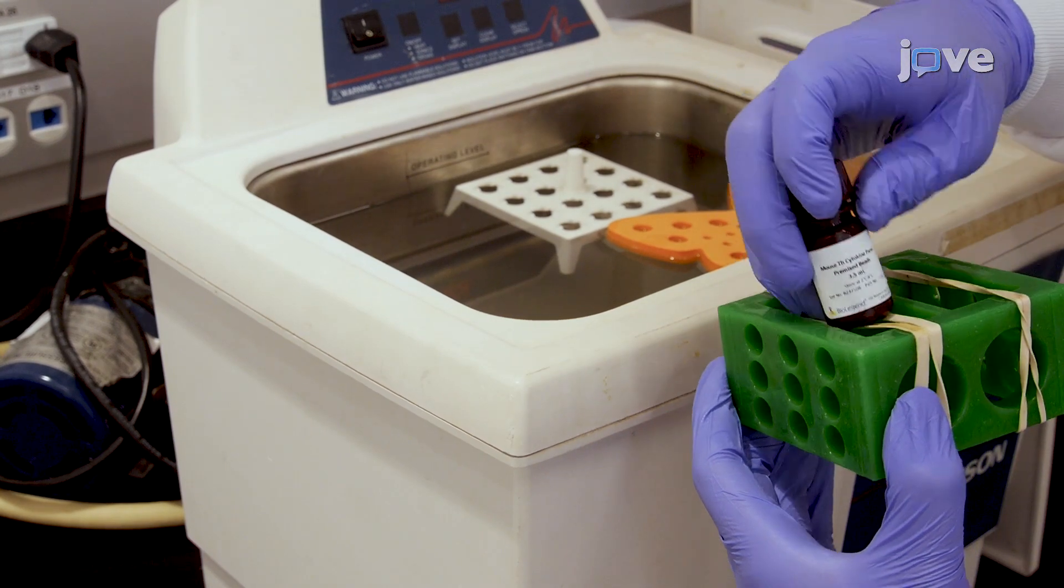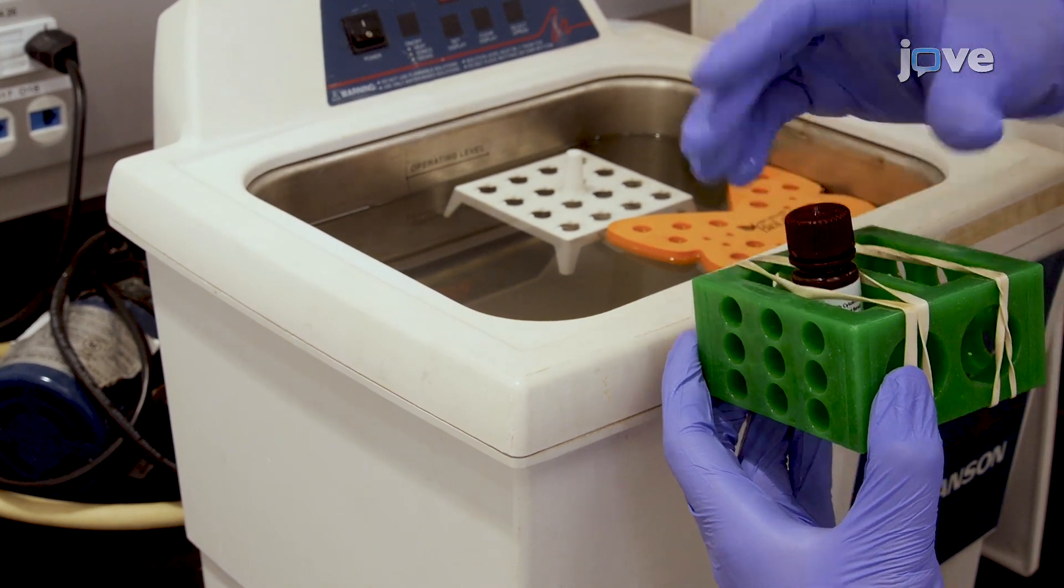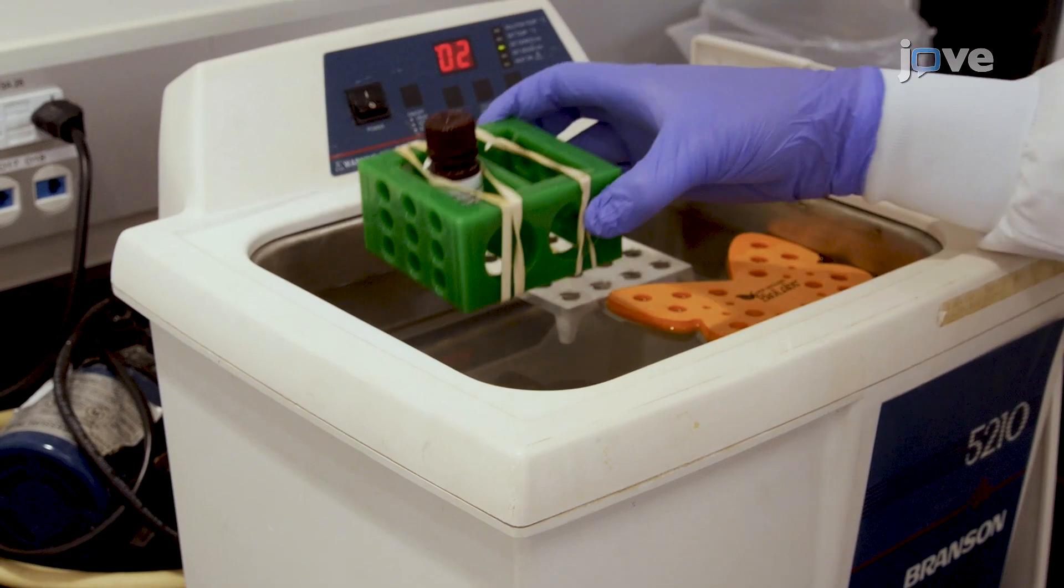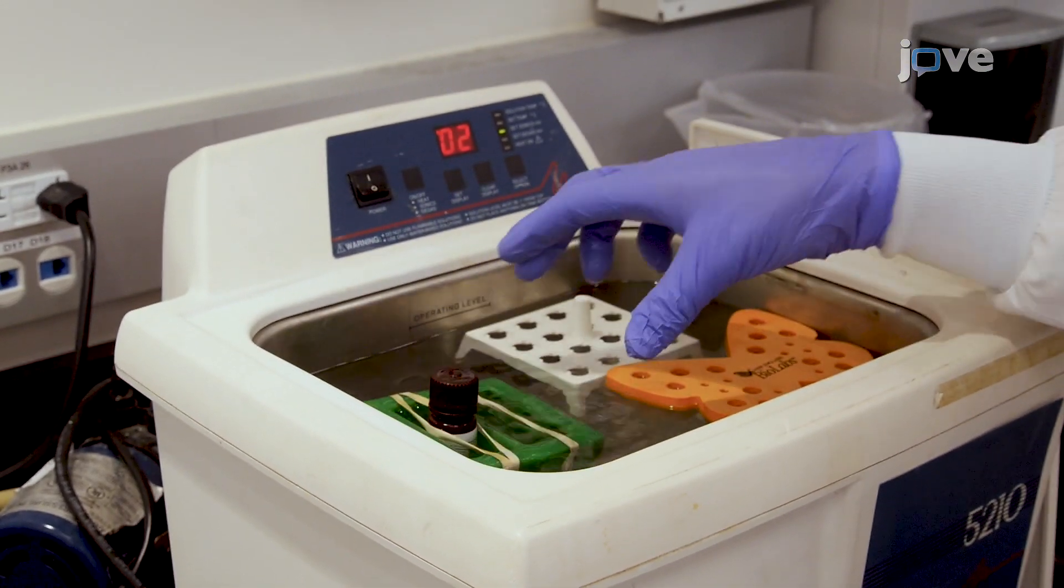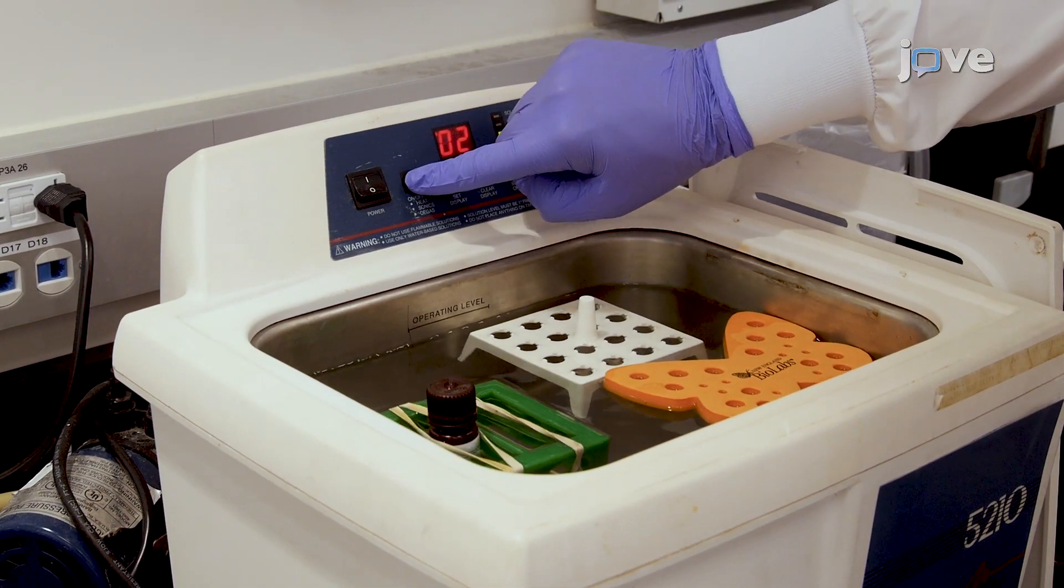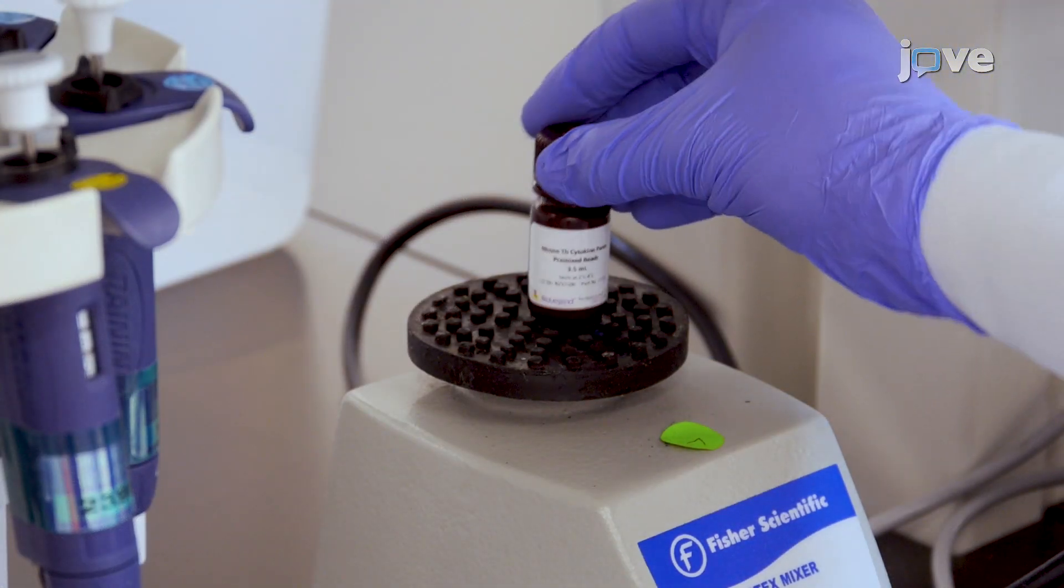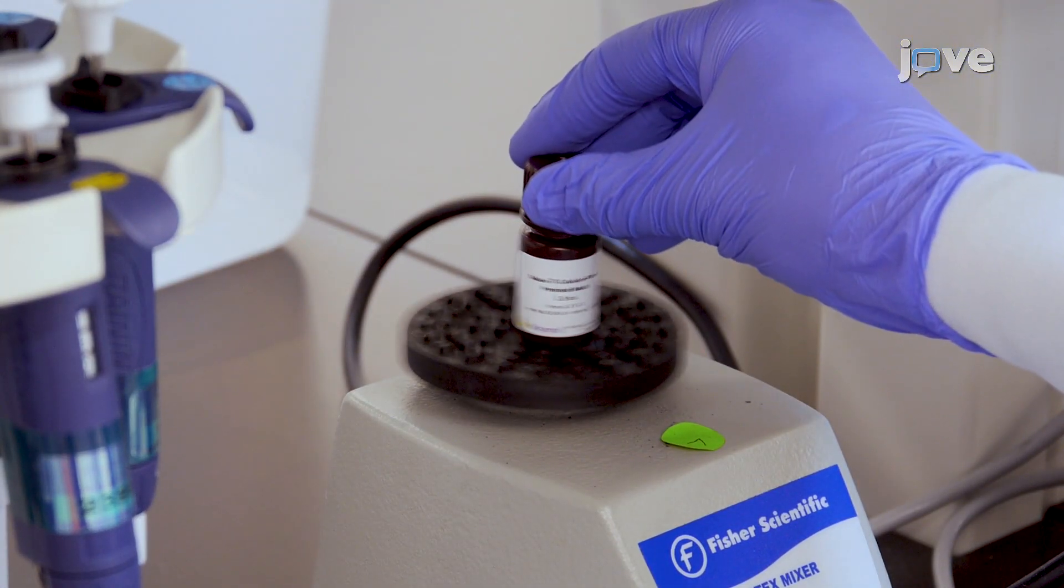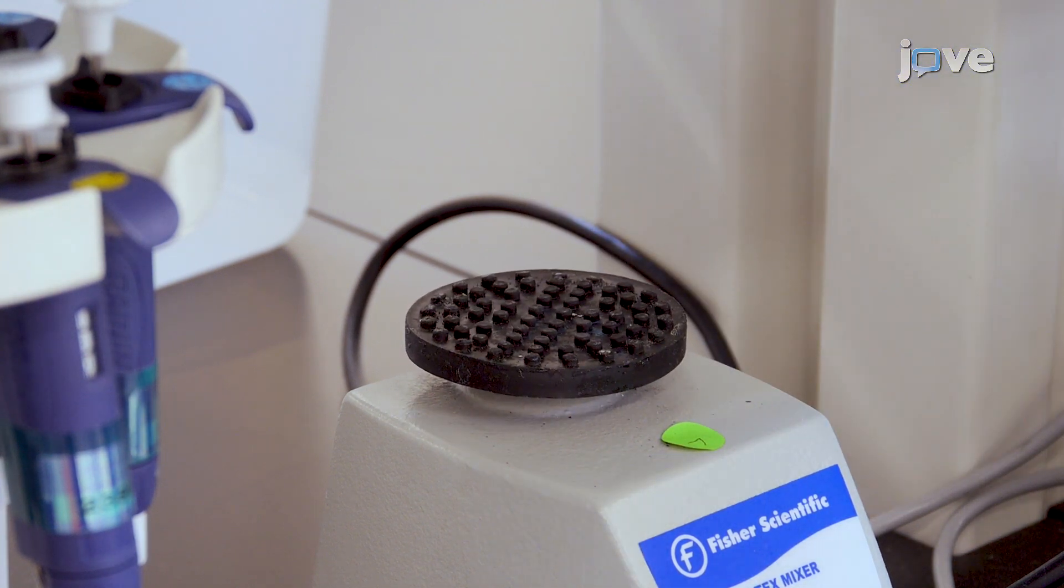To prepare the premixed antibody-immobilized beads, sonicate the premixed beads bottle for one minute in a sonicator bath at room temperature, then vortex for 30 seconds prior to use. If no sonicator bath is available, increase the vortex time to one minute.